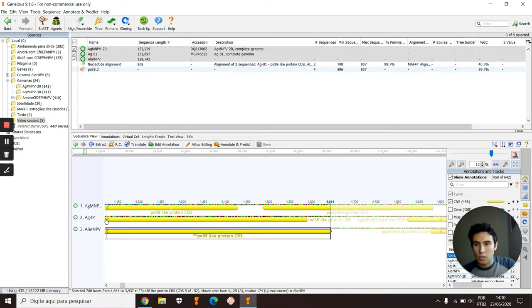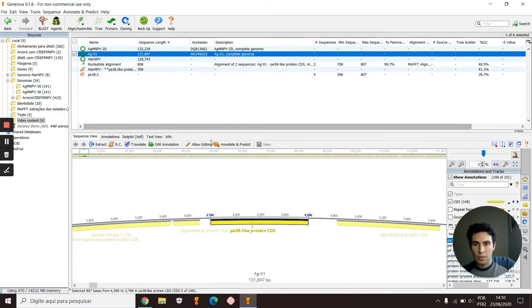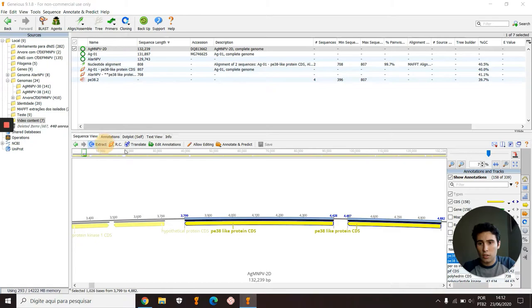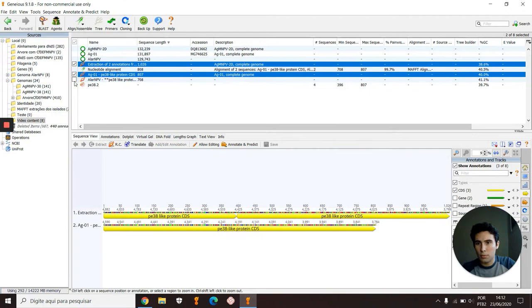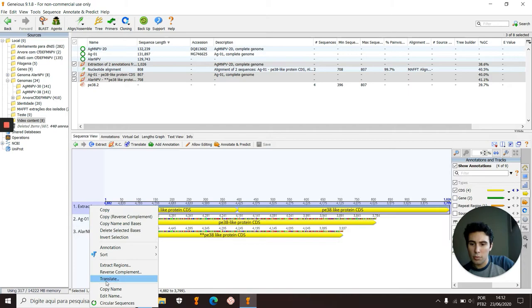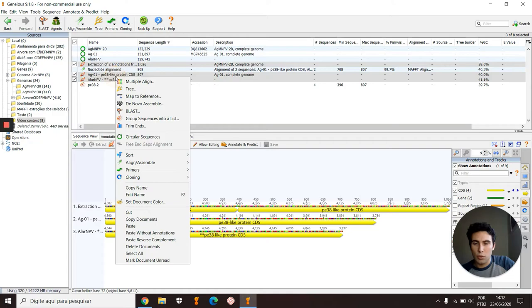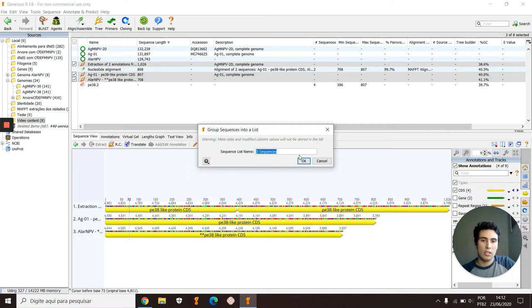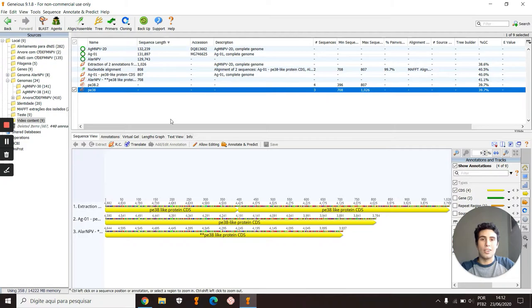One at a time, we will get the result that we want. Right here, for example, Alabama argillacea, extract. Extract these two with Control. Okay, and now we have this. We can change this name by Edit Name here if you want to. And we'll click with the right button of the mouse and go in Group Sequence into a List. I will call it pe38.